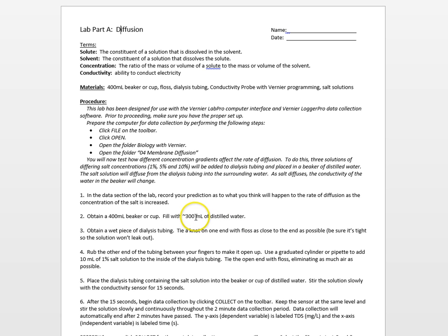Using a little bit less will help conserve some of the distilled water that's located in the containers on the cart. Once you have that set up ready to go, then you'll need to find your way to a computer. I have two laptops set up on the east wall, and on the south wall there's another computer back there. Those are all set up, ready to go.